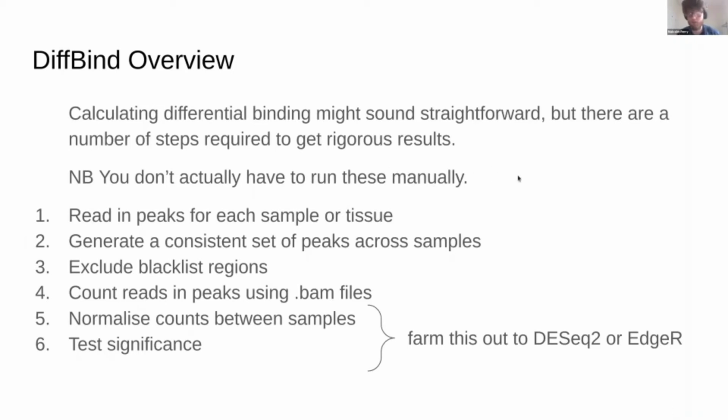When we use GenRich for peak calling, that's already done as we had done for several samples together. So there's already some kind of a building and consensus between samples then. You go with this peak calling, in a way already consensus peak calling, into this DiffBind?